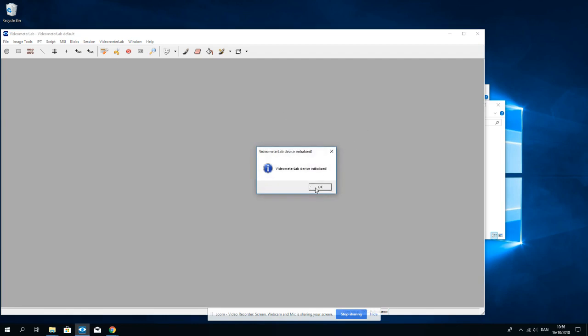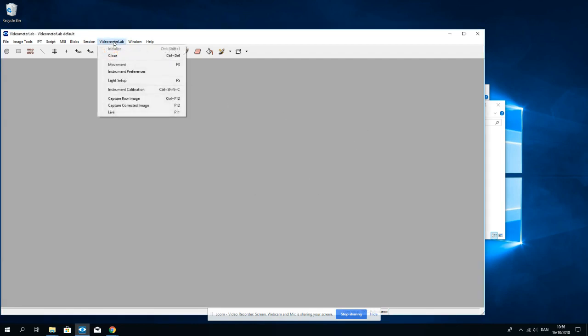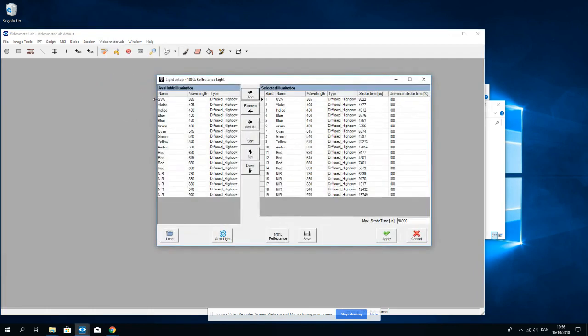Here we go. Now I will check the light setup. We can either choose a broad scope light setup with 100% reflections. That means it will fit for most purposes.